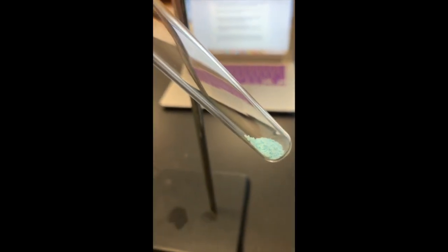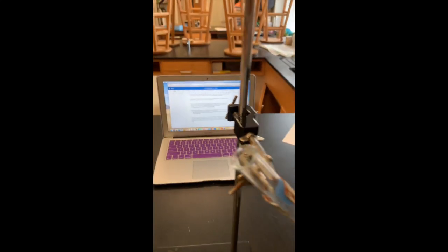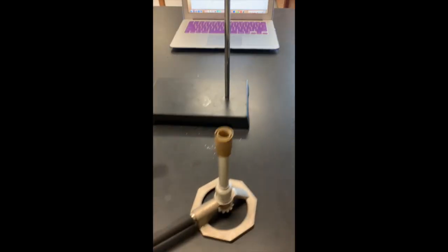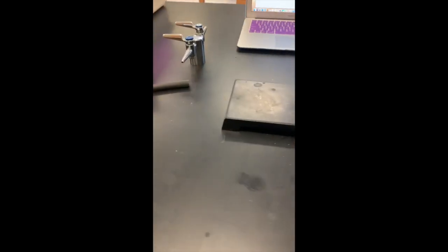I've added the copper sulfate to a test tube. This test tube is being held in a test tube clamp on a ring stand. This is all part of the setup for the Bunsen burner.